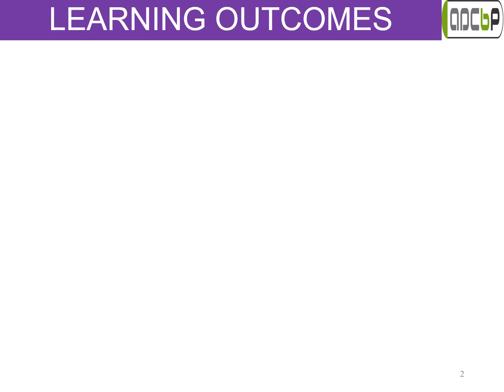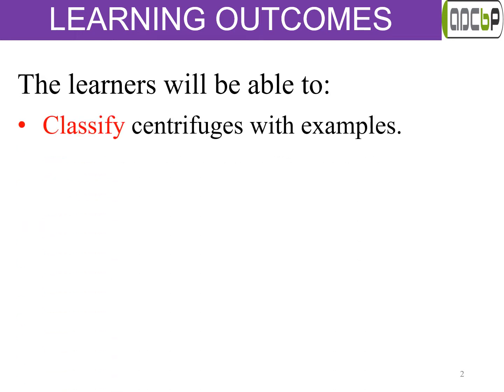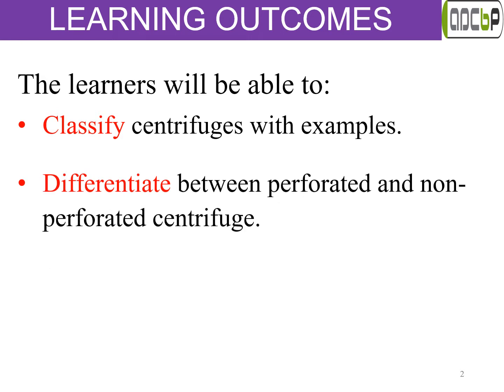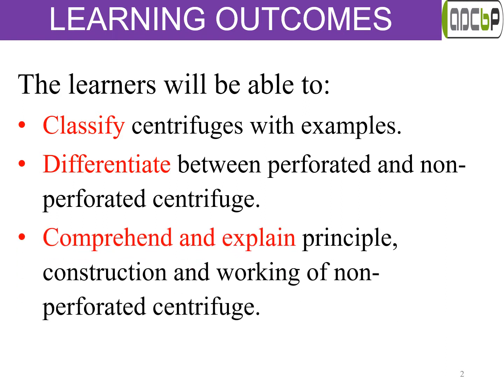Let us see the learning outcomes. At the end of this video, the learner will be able to classify centrifuges with example, differentiate between perforated and non-perforated centrifuge, and comprehend and explain principle, construction and working of non-perforated centrifuge.